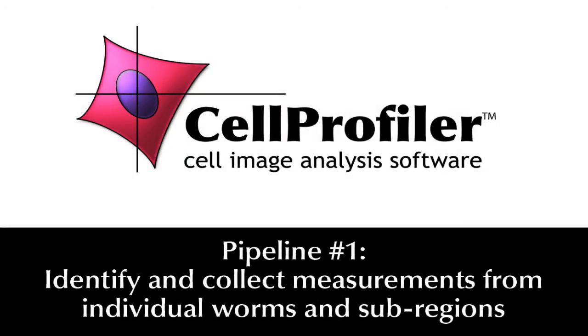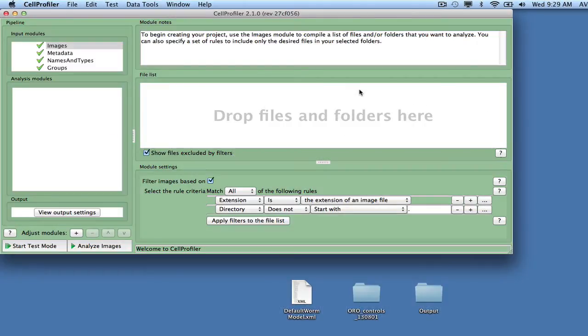For this tutorial, we will be building a pipeline to find individual worms in sub-regions and then extract measurements. To begin, start CellProfiler 2.1.